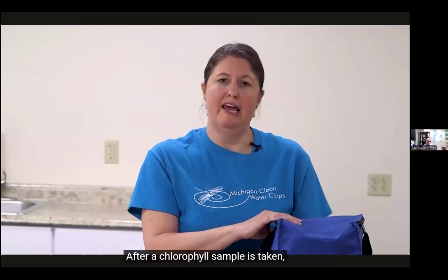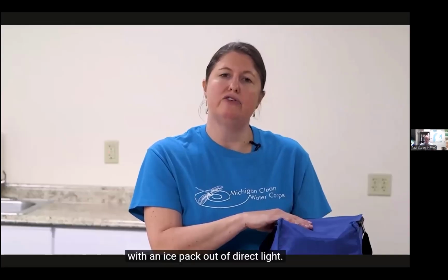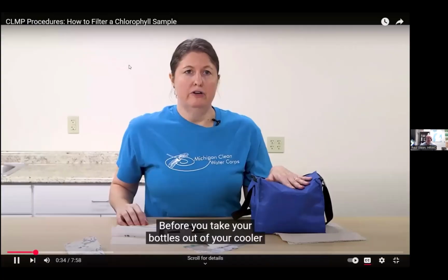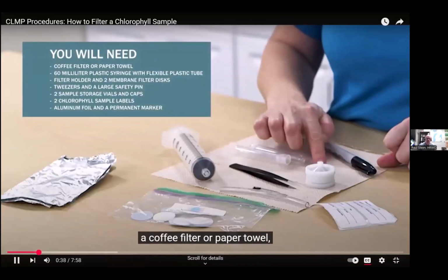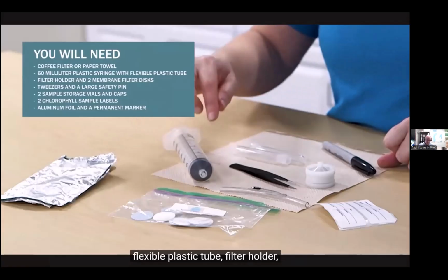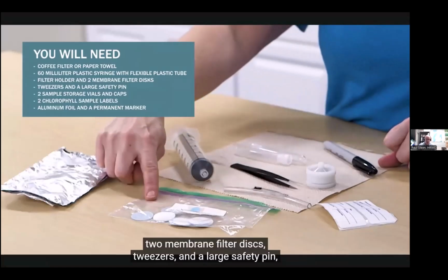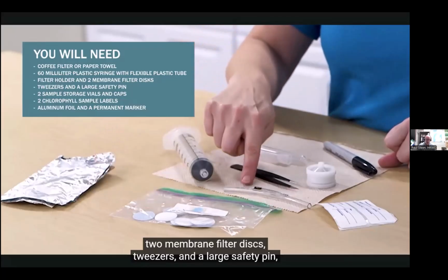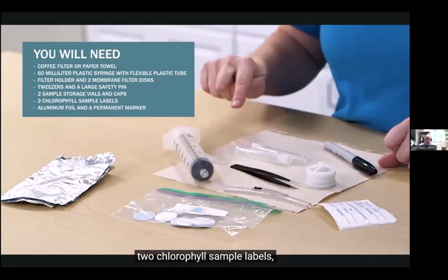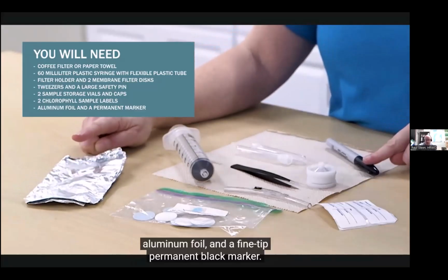After a chlorophyll sample is taken, the brown bottles should be kept in a cooler with an ice pack out of direct light. Before you take your bottles out of your cooler, check and make sure you have all of your equipment. A coffee filter or paper towel, a 60 milliliter plastic syringe, flexible plastic tube, filter holder, 2 membrane filter discs, tweezers and a large safety pin, 2 sample storage vials and caps, 2 chlorophyll sample labels, aluminum foil, and a fine tip permanent black marker.